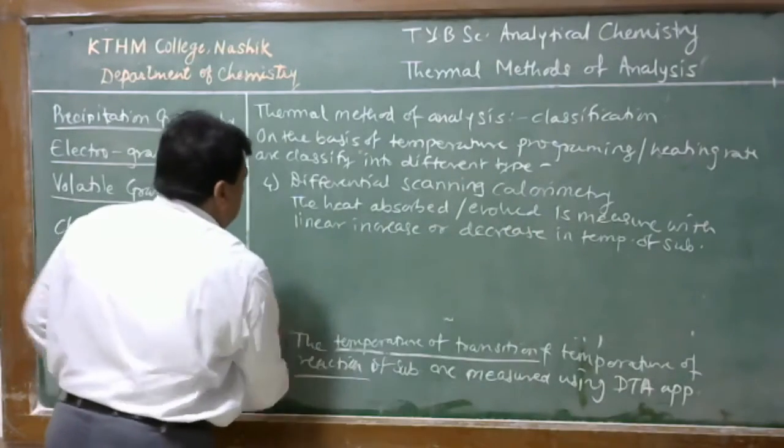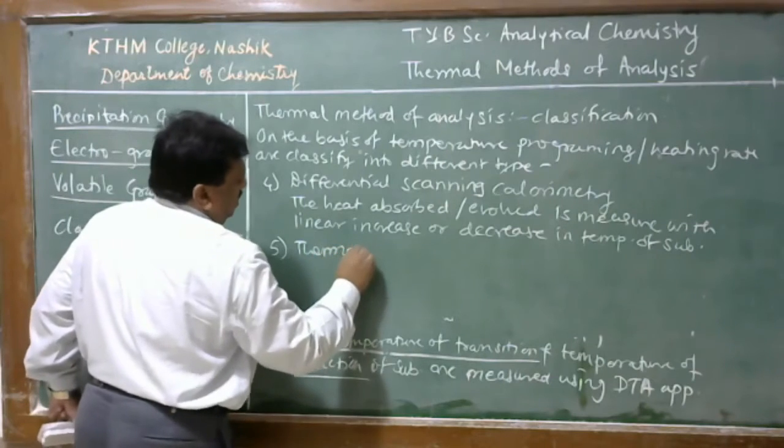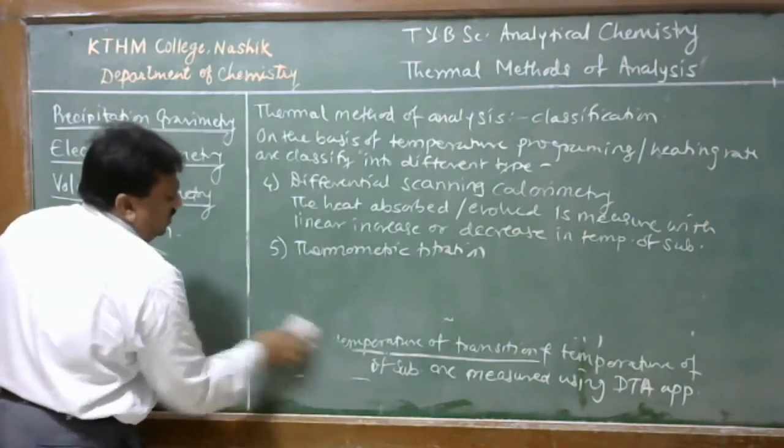Next, number 5 is called thermometric titration, and now it is very well known to you.